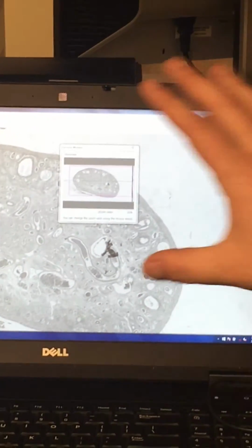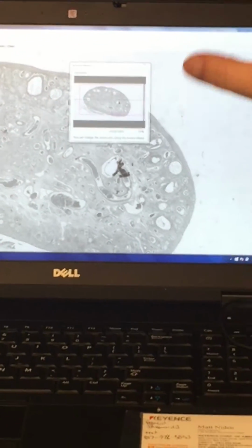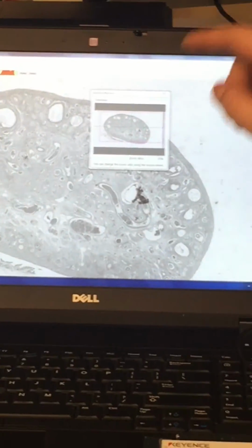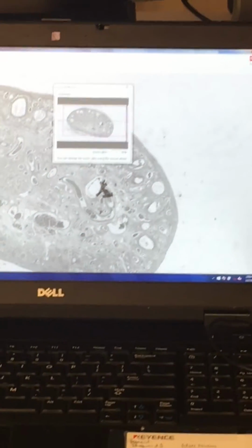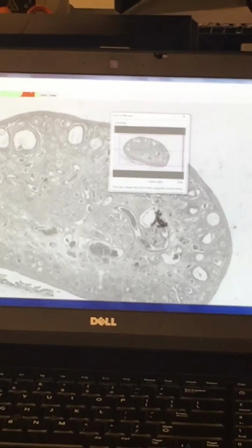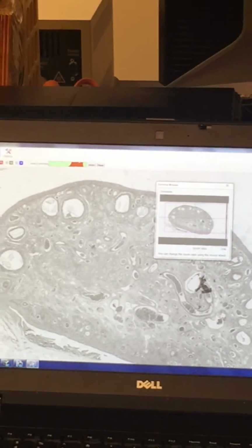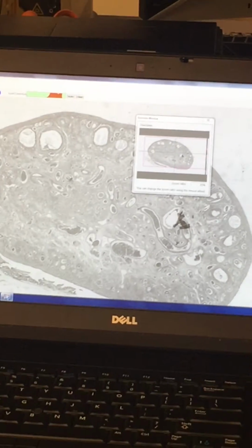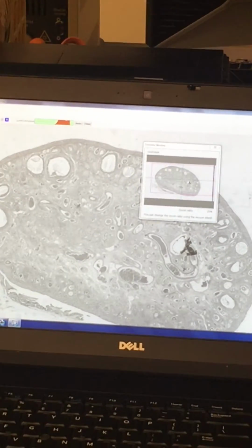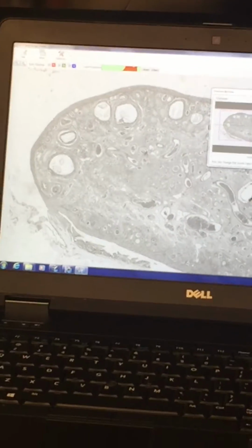One thing about this software here is this is our wide image viewer. This is only compatible with KTL file formats. I still don't know what that stands for. So it's like a Keyence proprietary format. Up until about a year or so ago, you could only save KTL formats with this. We realized that that's not very compatible or user-friendly amongst other softwares. So if you want to save this as KTL, go for it. It's only going to open up in this software.